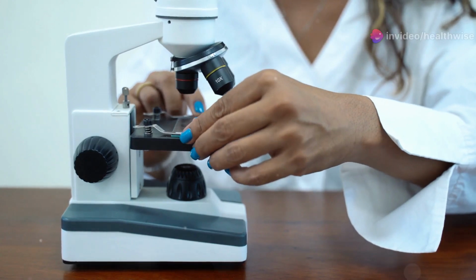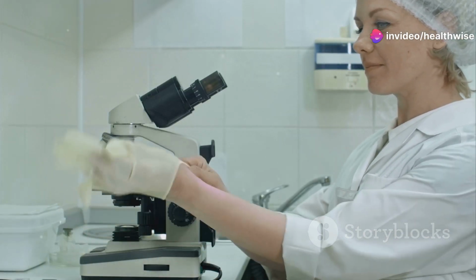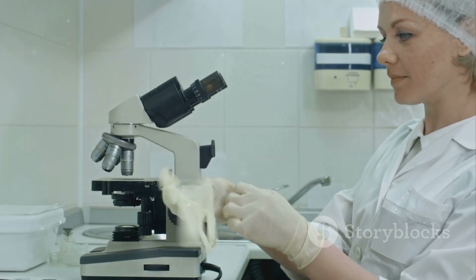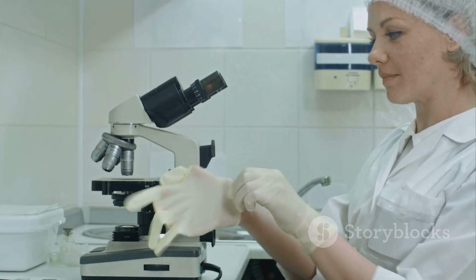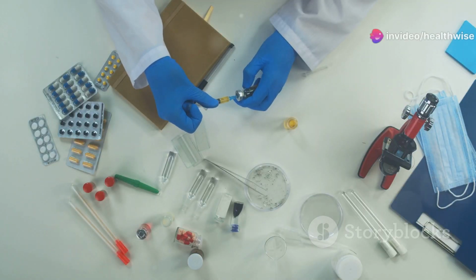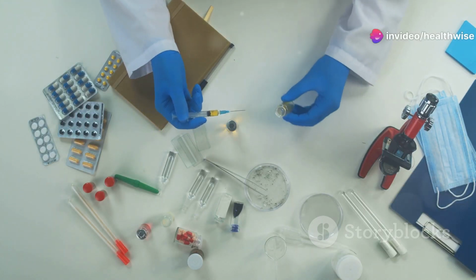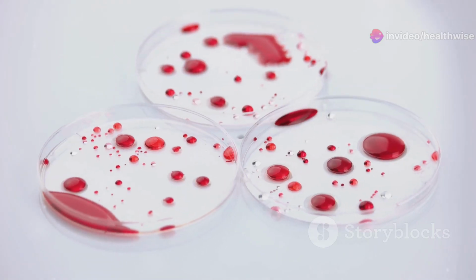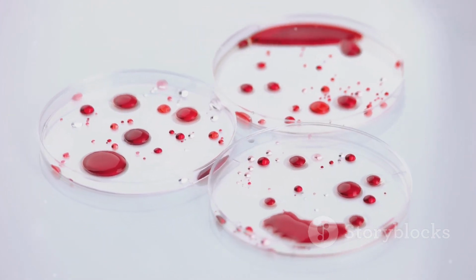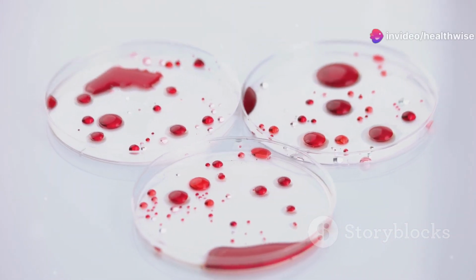Let's dive right in. First, you'll need a small portion of the feces. This sample is the foundation of our examination. Make sure to grab samples from both the exterior and the central portion of the fecal mass. This ensures that we get a representative sample for our examination. If the feces are blood-stained, ensure your sample includes blood and mucus. These elements can provide crucial information about potential gastrointestinal issues.